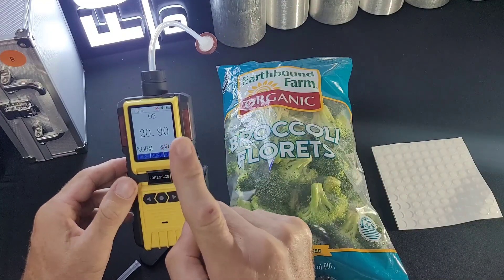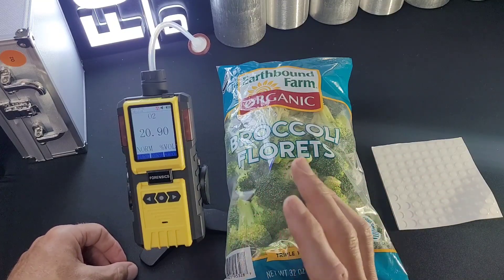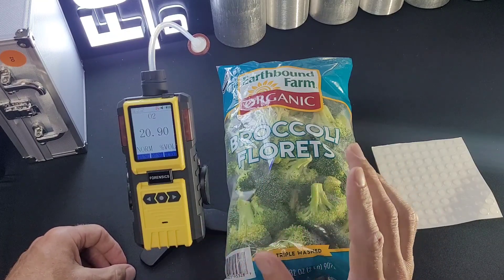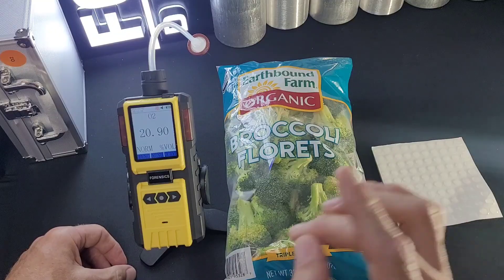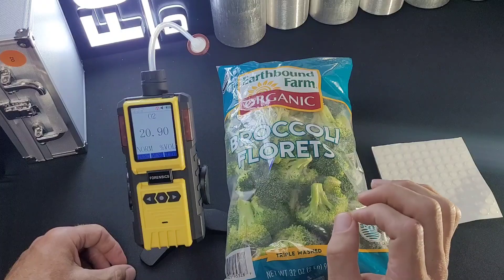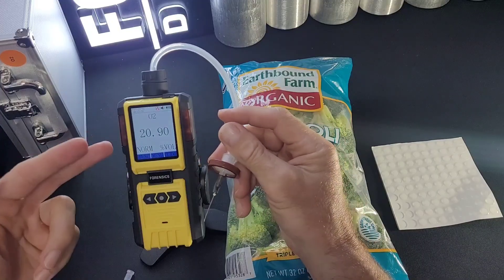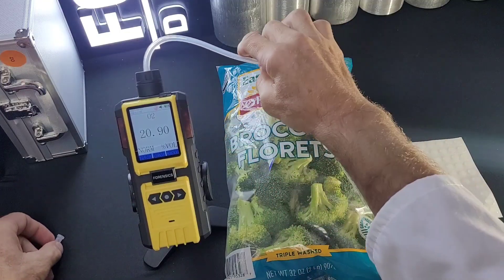Before you start, make sure it is reading 20.9% — very important — and make sure your unit is calibrated. We recommend between six to twelve months of regular calibration. It's important for accuracy; you want to make sure it is reading 0.1% of oxygen. When you start, you always want to confirm it's reading 20.9%, which is the oxygen level in the atmosphere. The unit is drawing air from the indoor environment, which is 20.9%, and we're showing 20.9%.